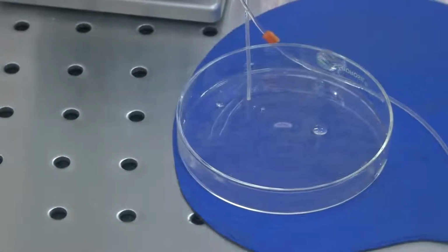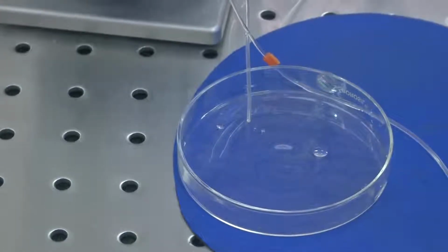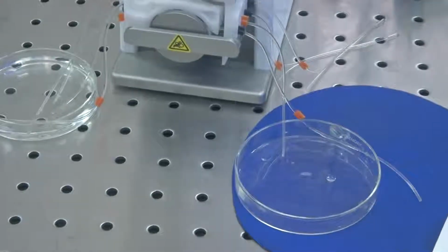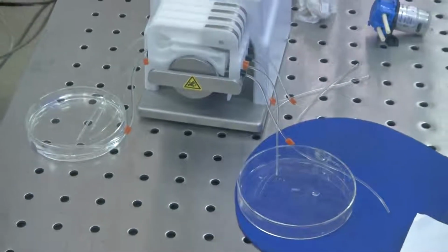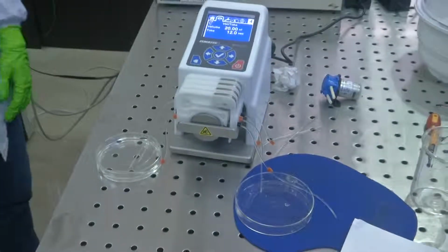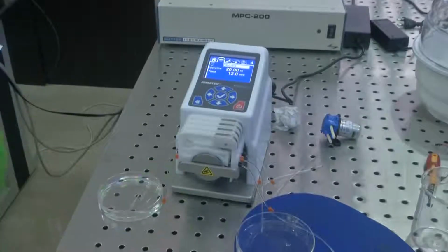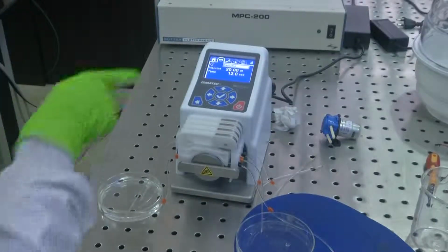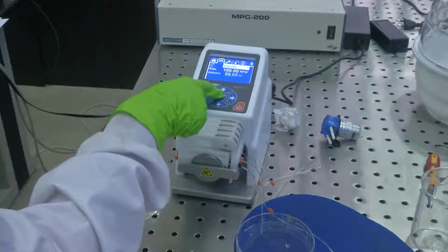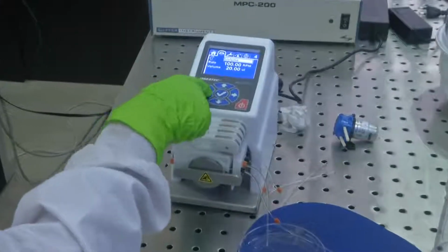you could relatively get your hands on the device. So, now that you have got the idea about the functioning of the peristaltic pump, how you can change the volume, you can change the time, you could change the direction of rotation, and there is another feature, you could actually flow the fluid, pause it for some time and then again continue. So, we are on the 4th cassette, and now we have set the volume and time. So, this is at the volume setting. So, let us see if we could change.